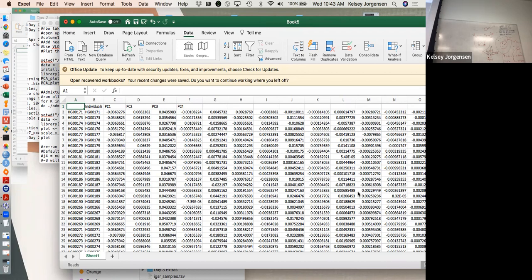Okay. So then go to Excel and I do get data from text right there, so that button. And then open that file. Yep, that one. And then for import, tell it it's delimited, and hit load. Now it's in different columns, so you need to just relabel. Delete that temporarily.